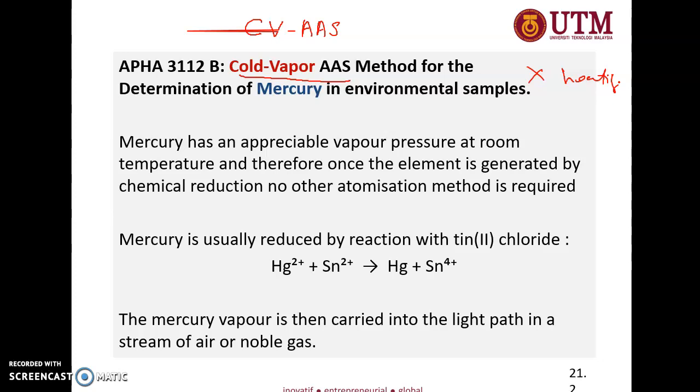Because this system works to produce atoms of one element and only one element, i.e. mercury. This system enables mercury to be atomized at, or near, room temperature.